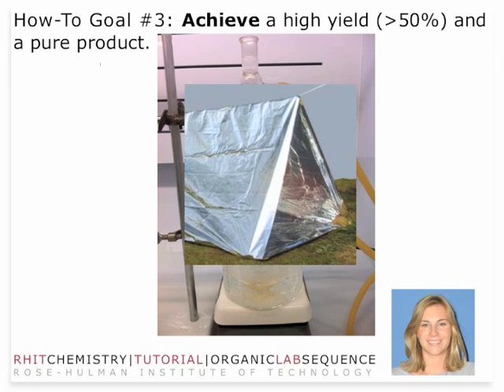Here's the foil tent. You probably won't need this in this reaction, but you'll likely need it next week. The goal is to wrap your condenser column in foil to keep the heat in. You don't want to wrap it tight like you're preserving food — you want to make a tent, larger at the bottom and smaller at the top, so you have a convection process that redistributes the heat from the bottom up.